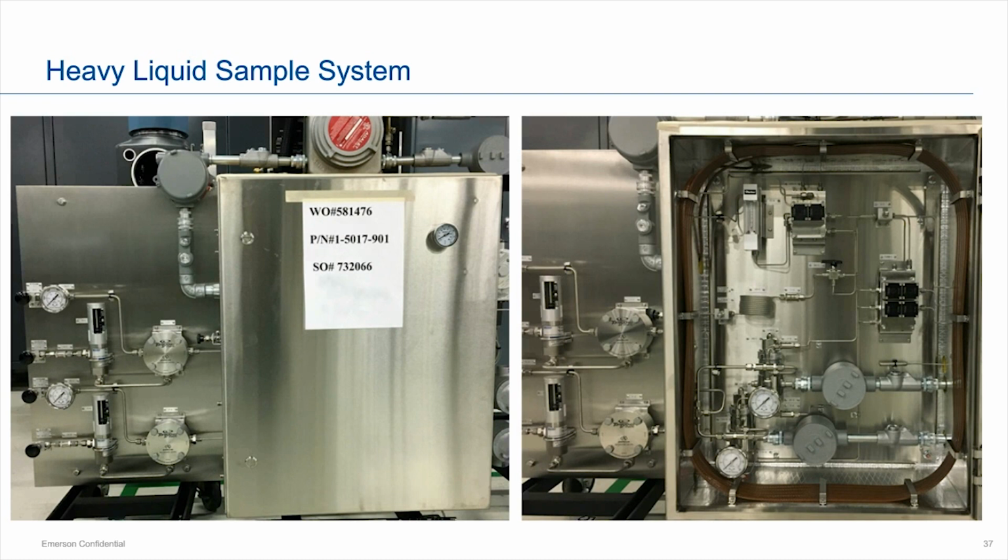If we look closely too, this is actually a two-stream coming in. So we have a double block and bleed. We also have an ARV and a flow control. If you squint, in the center of the right photo, you'll see a coil. That's a vaporizing coil, and that's for the liquid calibration coming in. So you'll have that vaporized coming in, and a little bit past the vaporizer, you'll see that again we have more filtering.